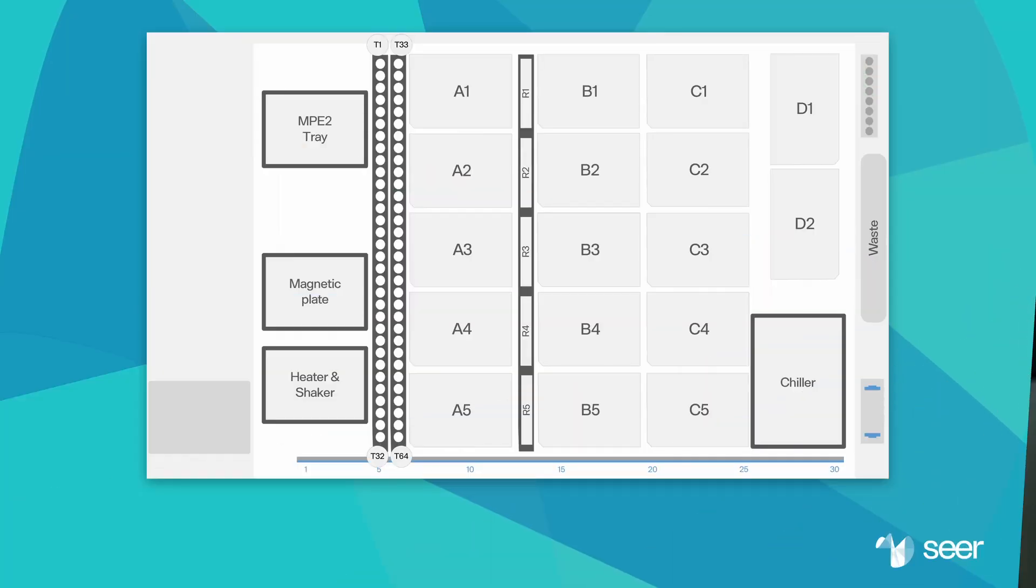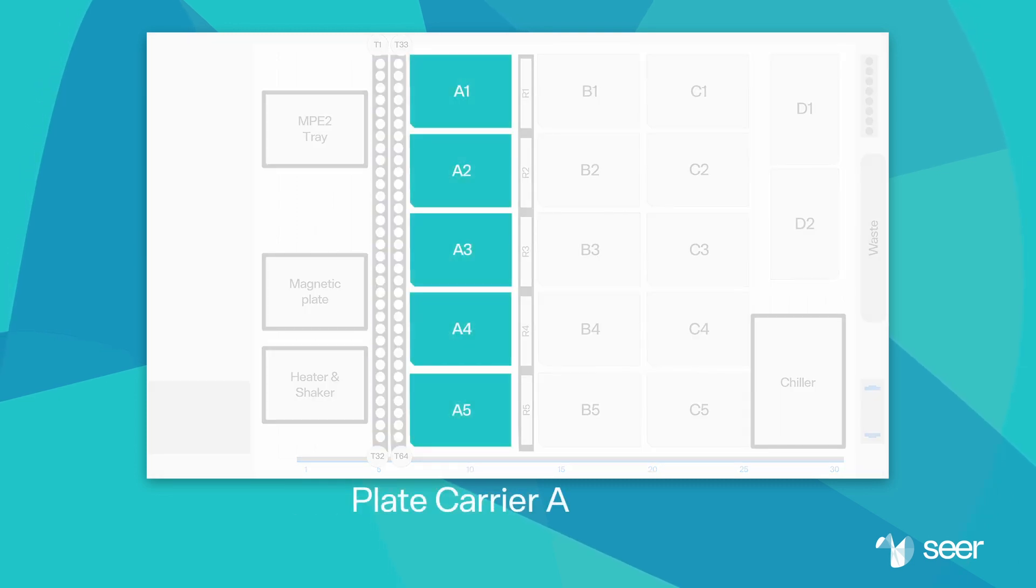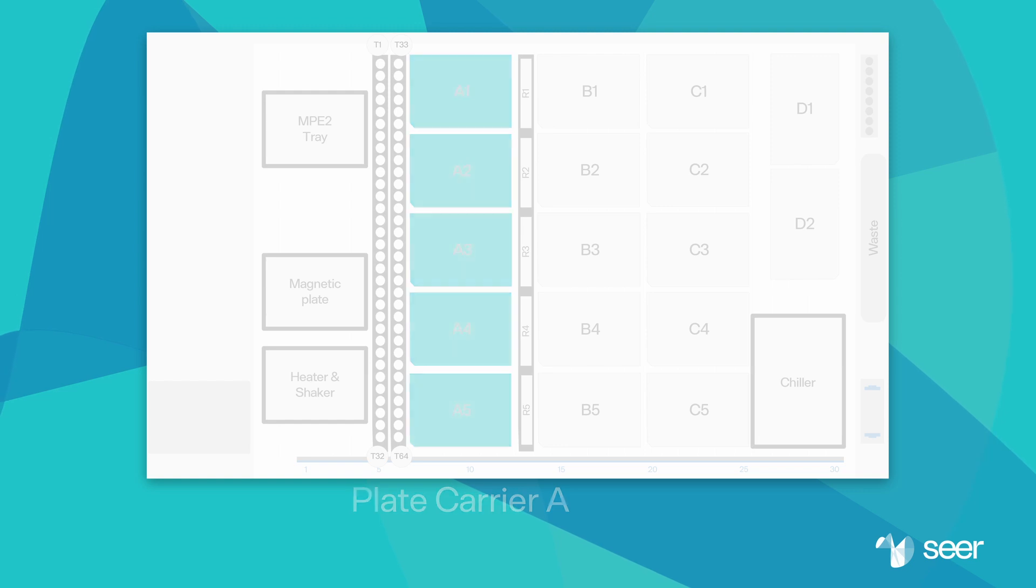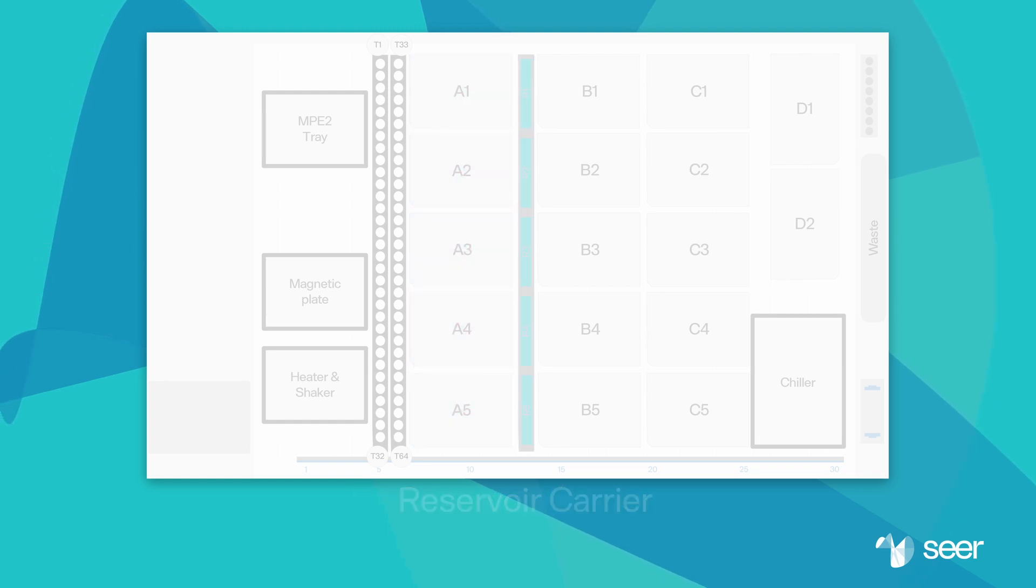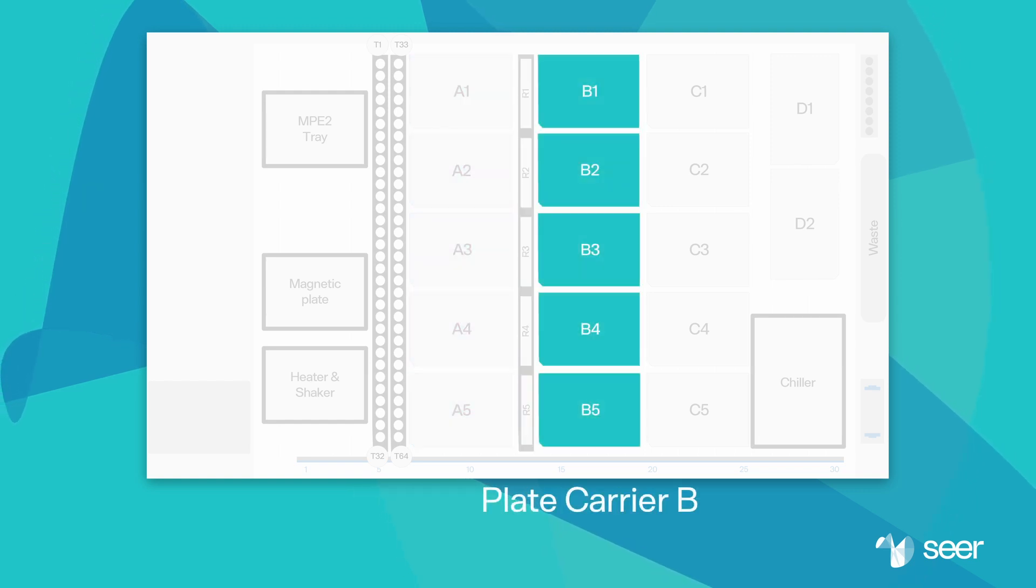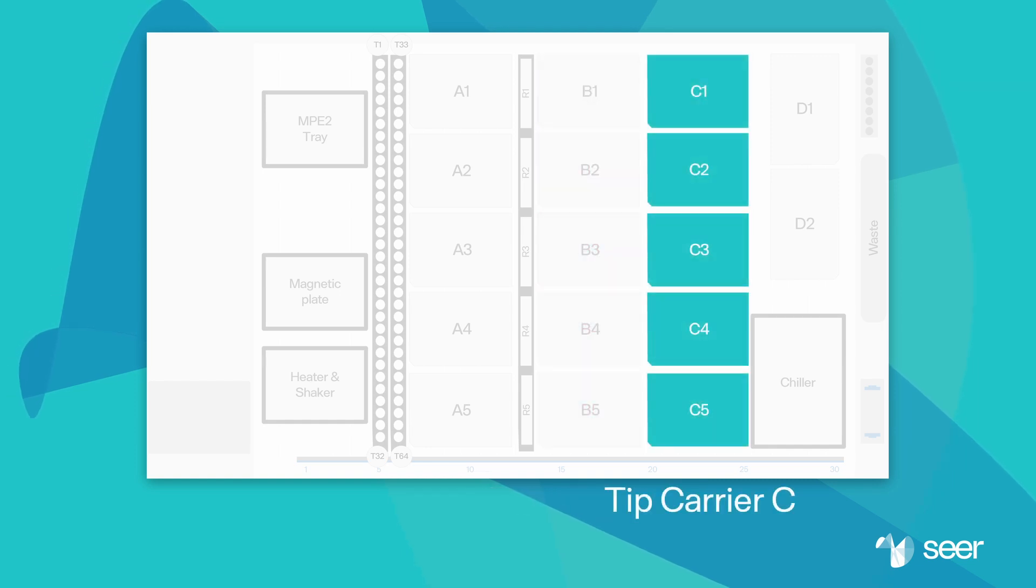The work deck includes movable carriers for loading labware onto the SP100. There are two tube carriers, plate carrier A, reservoir carrier, plate carrier B, and tip carrier C.